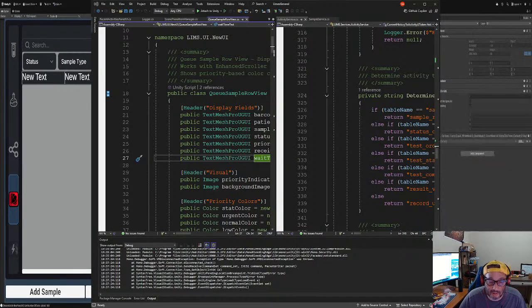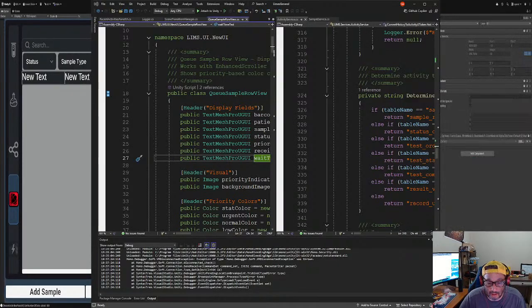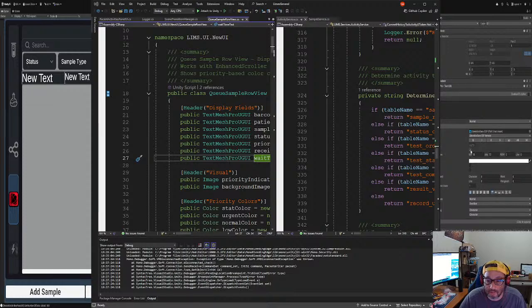We're gonna make it the same pattern as before, which is good. The reason why you want all of them to have the same pattern is because it'll be easy to debug, right? And then you're following the same pattern. So, all right. And then let me see this. Okay, so I'll fix one, and then I'll be able to fix all of them. Okay, so we're gonna do vertical, horizontal. Then we go 5, 5. No, that's 2. I pressed 2, 2, 2, 2. All right. So then we just copy and paste.